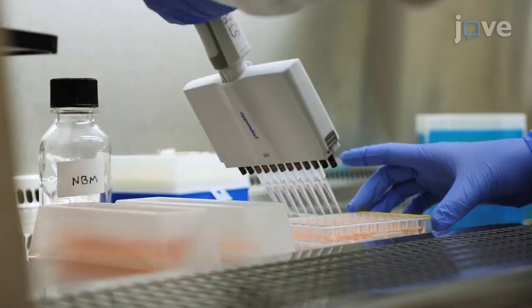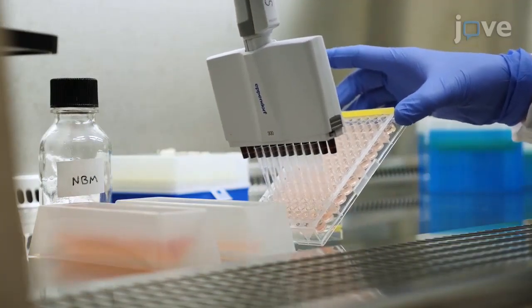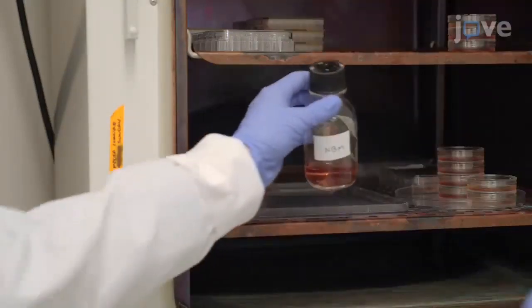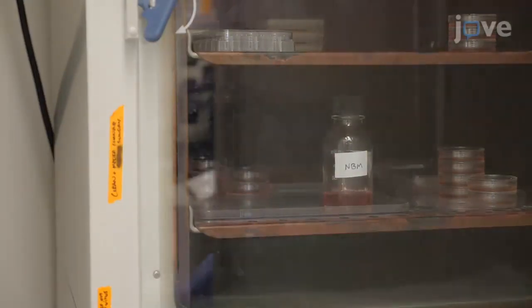Use a multi-channel pipette and sterile plastic troughs to wash the cortical neurons 2 times with 100 microliters of neurobasal media per well. And store the conditioned media and other remaining media at 37 degrees Celsius.